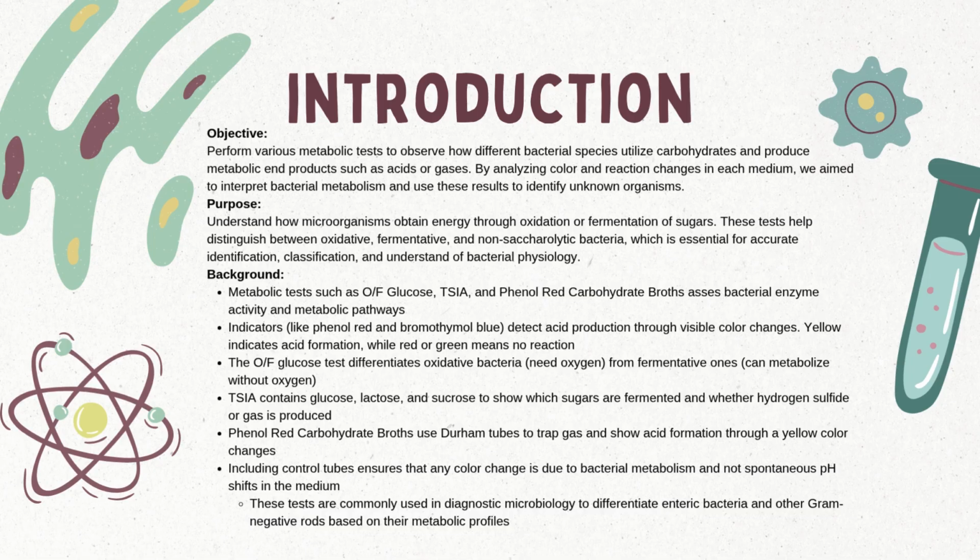So hi everyone, today our group's lab focused on metabolic tests, basically how different bacteria use or break down carbohydrates and what metabolic products they produce. The main objective was to observe how these bacteria generate acids or gases through carbohydrate utilization and interpret those reactions to help identify unknown organisms.